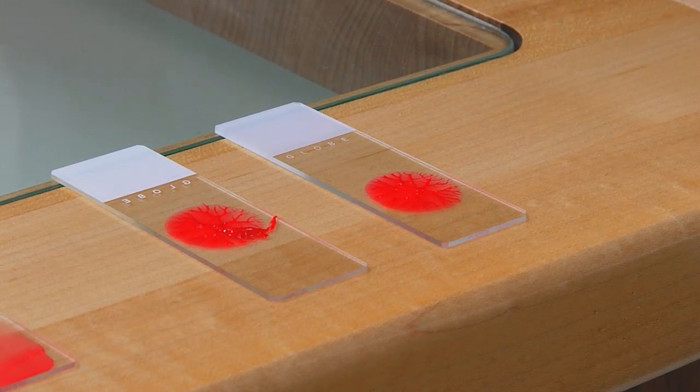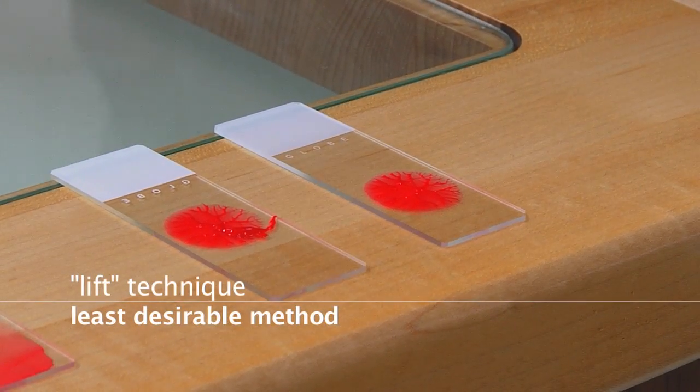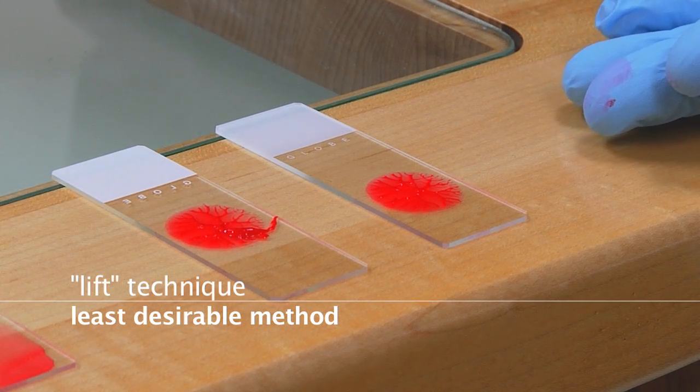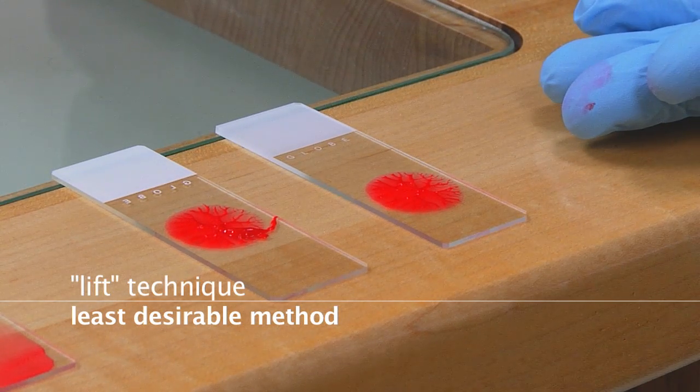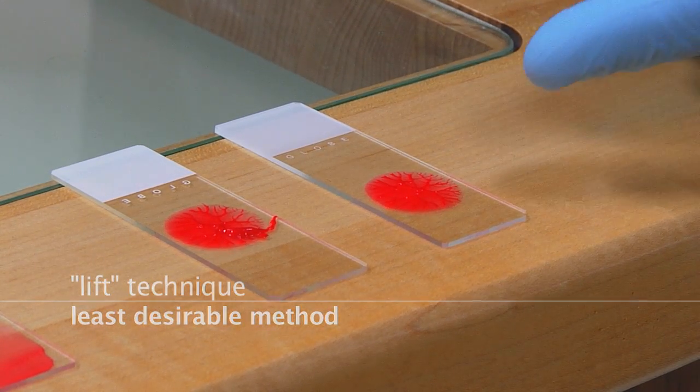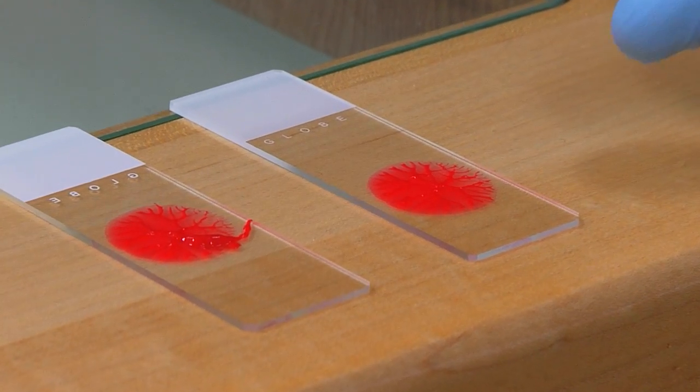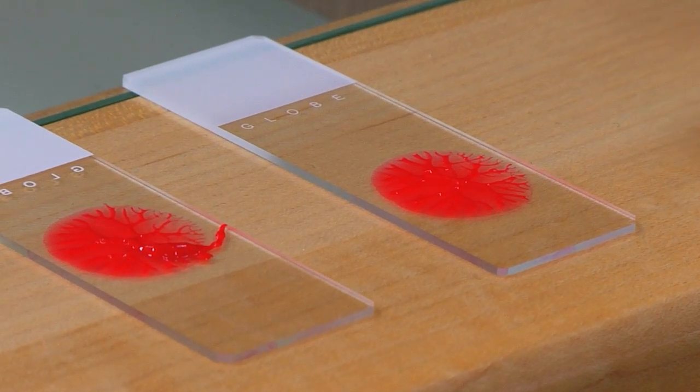As you can see the slides from the three techniques are laid out here. One on the extreme right is the least desirable technique because as said before it creates valleys and ridges in the material that lead to suboptimal fixation of the material and hence the staining characteristics of the cytology material on these slides is suboptimal.